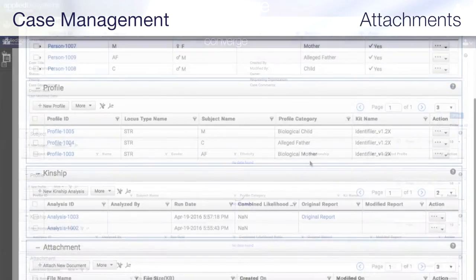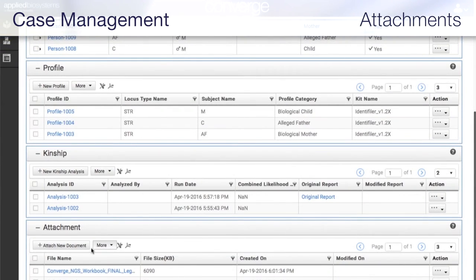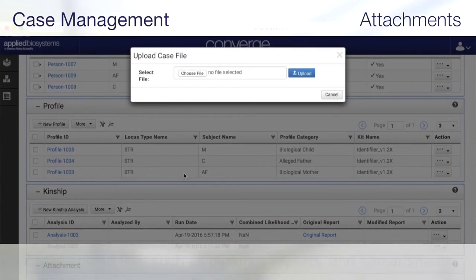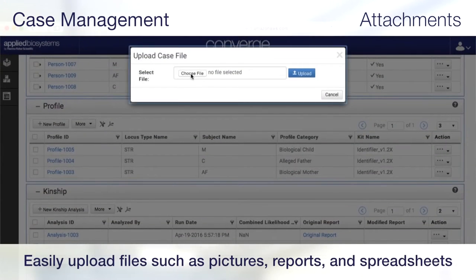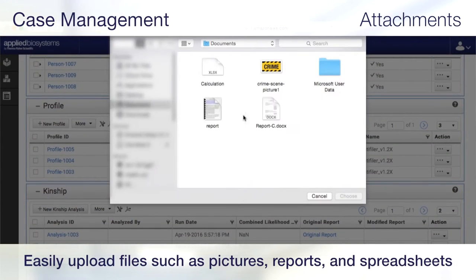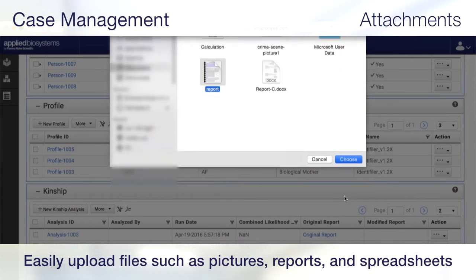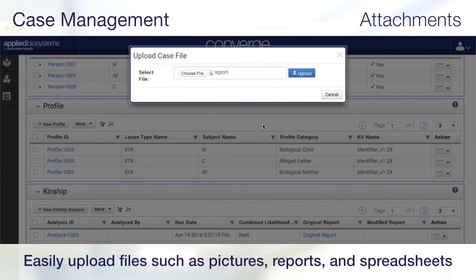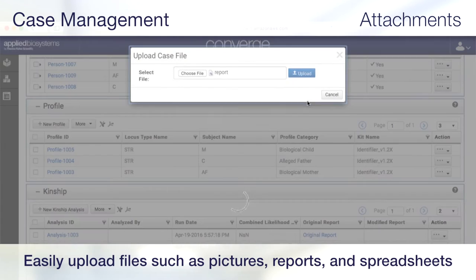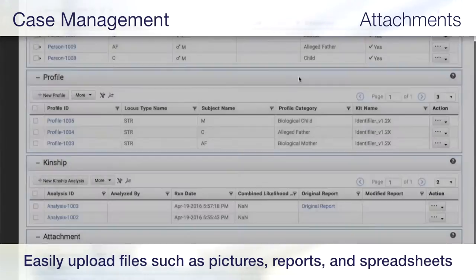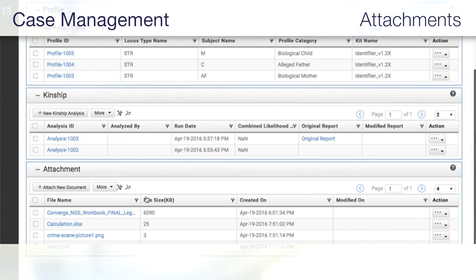With the attachments feature, you can easily upload files like crime scene pictures, Microsoft Word case report documents, and Microsoft Excel sample sheet files, organizing all the case information in one location.